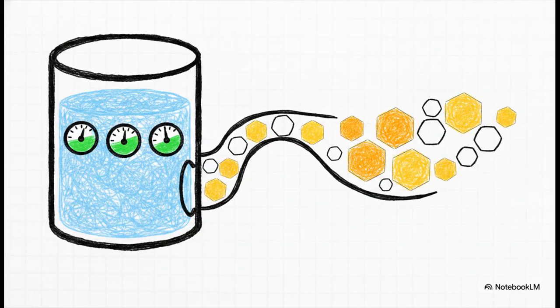Now, it's really tempting to think of this empty-full ratio as purely a downstream purification problem, like we'll just sort it out later, right? But in reality, upstream consistency directly affects the proportion of full genome-containing capsids you get in the first place. The health of your cells, the exact timing of the transfection, the specific conditions inside that bioreactor. Mastering those parameters is exactly how you maximize your yield of full, effective vectors before purification even begins.